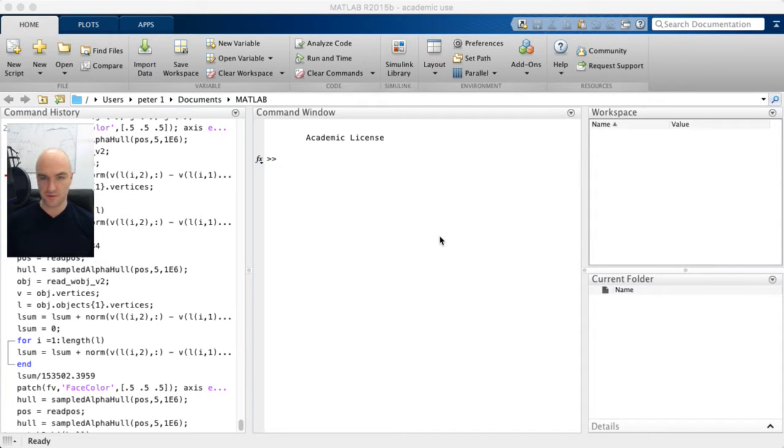The reason why I use Matlab, and I don't just use Matlab, I also use other programs, some of which you will see later on, is that it's an interpreted language. That means you always have the code going with everything, so you can look into the code and see what it does, alter things, make it work for you, and always dig deeper into the data.